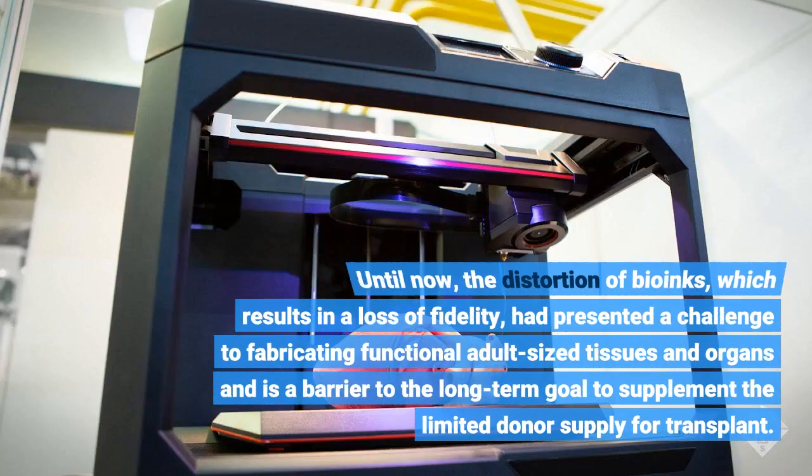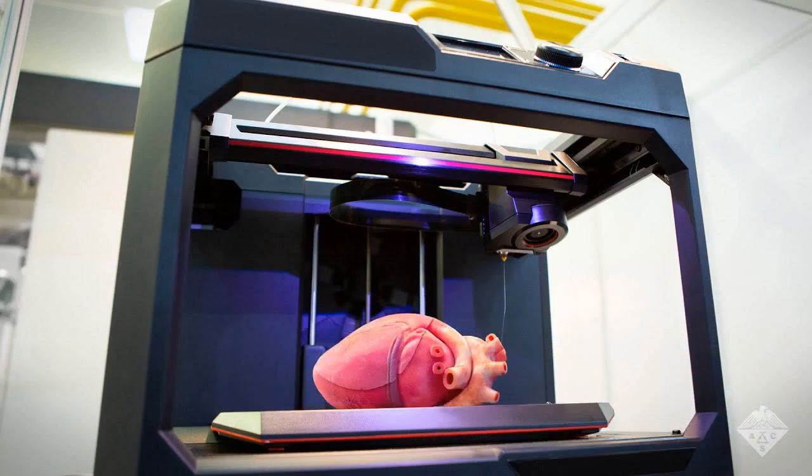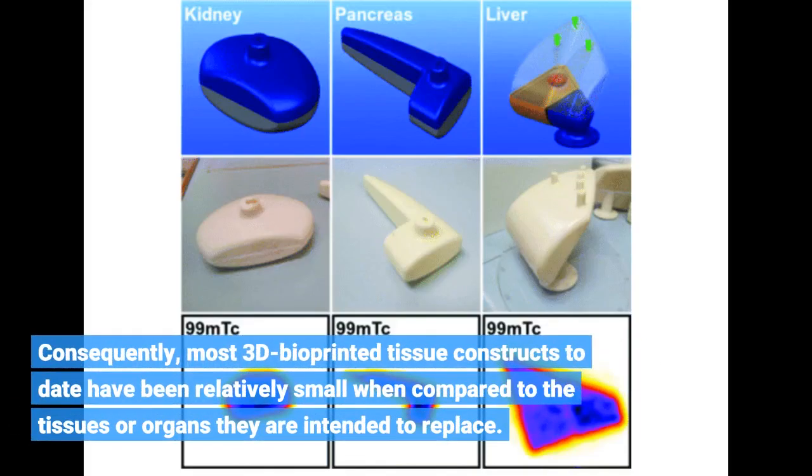Until now, the distortion of bioinks, which results in a loss of fidelity, had presented a challenge to fabricating functional adult-sized tissues and organs, and as a barrier to the long-term goal to supplement the limited donor supply for transplant. Consequently, most 3D bioprinted tissue constructs to date have been relatively small when compared to the tissues or organs they are intended to replace.